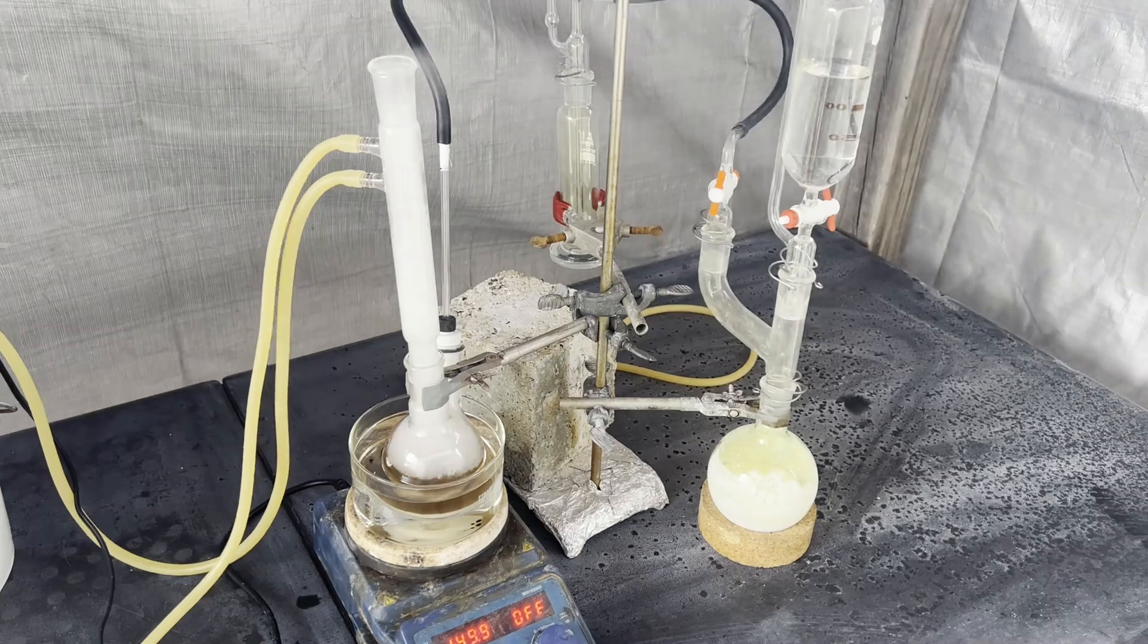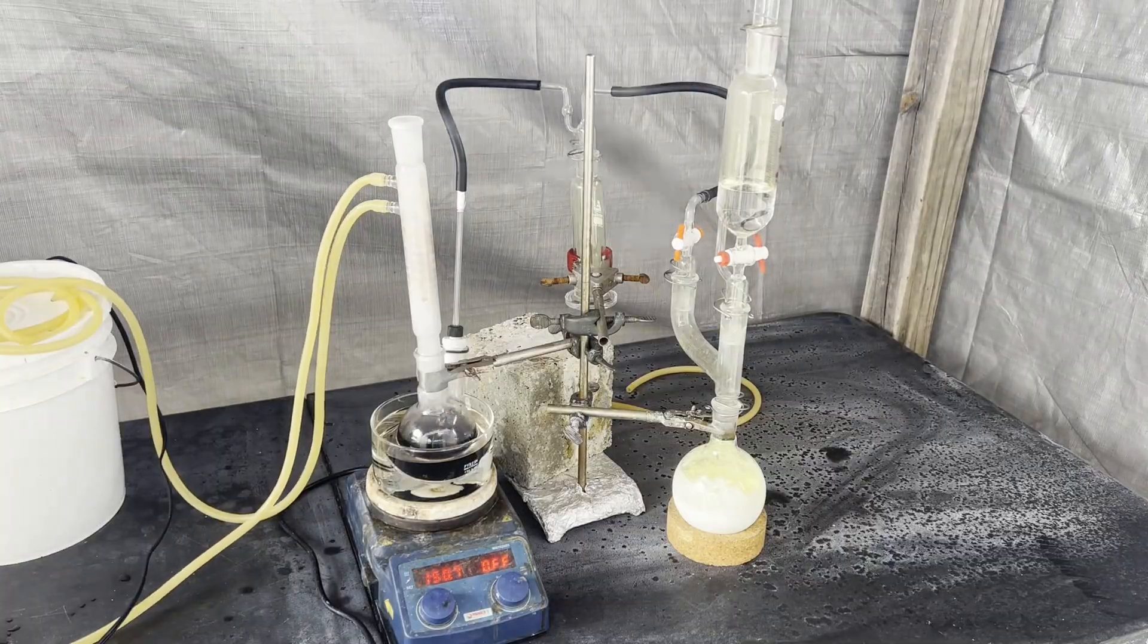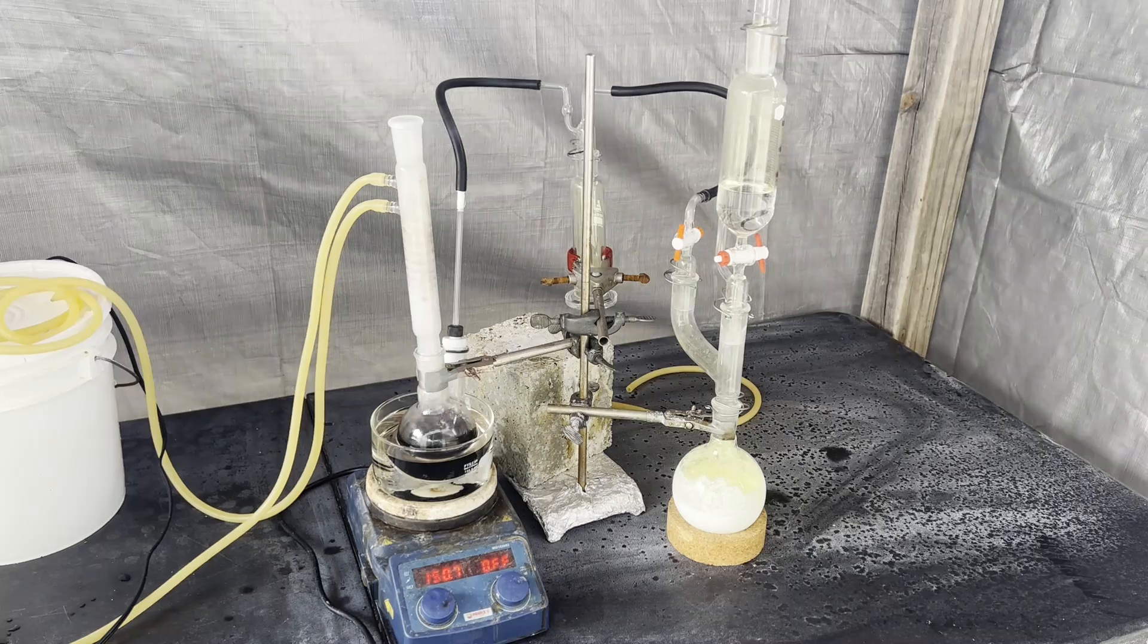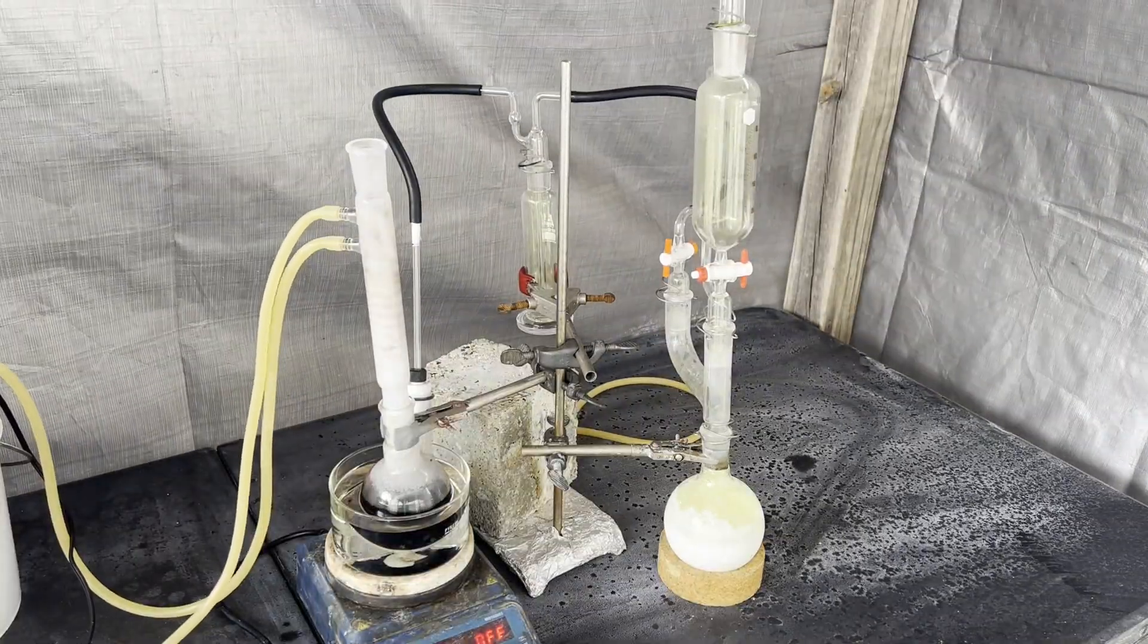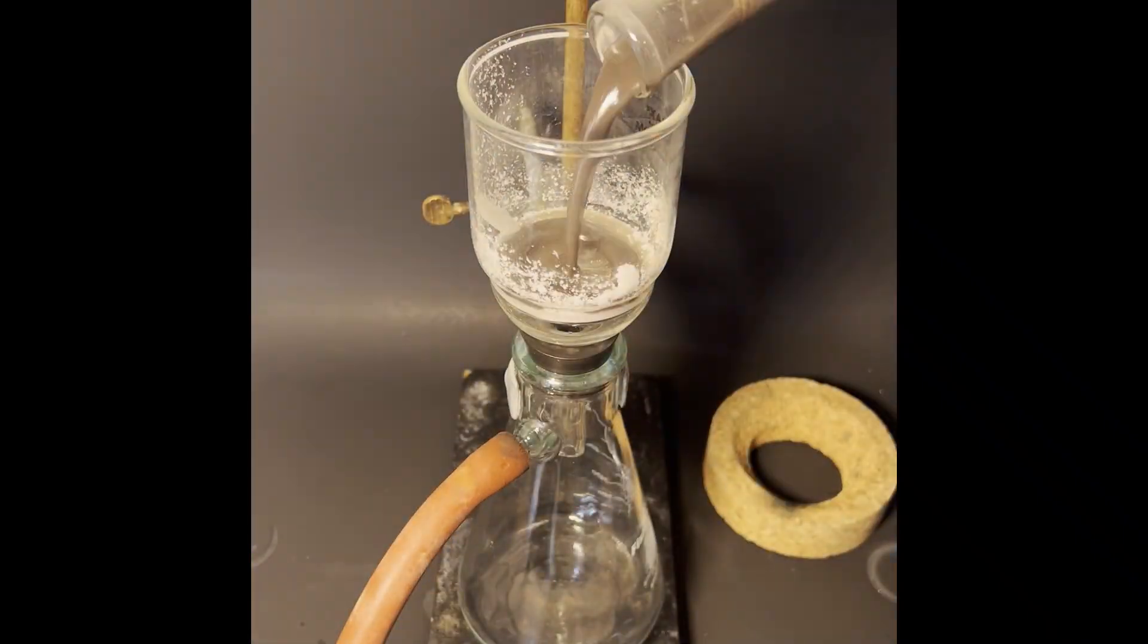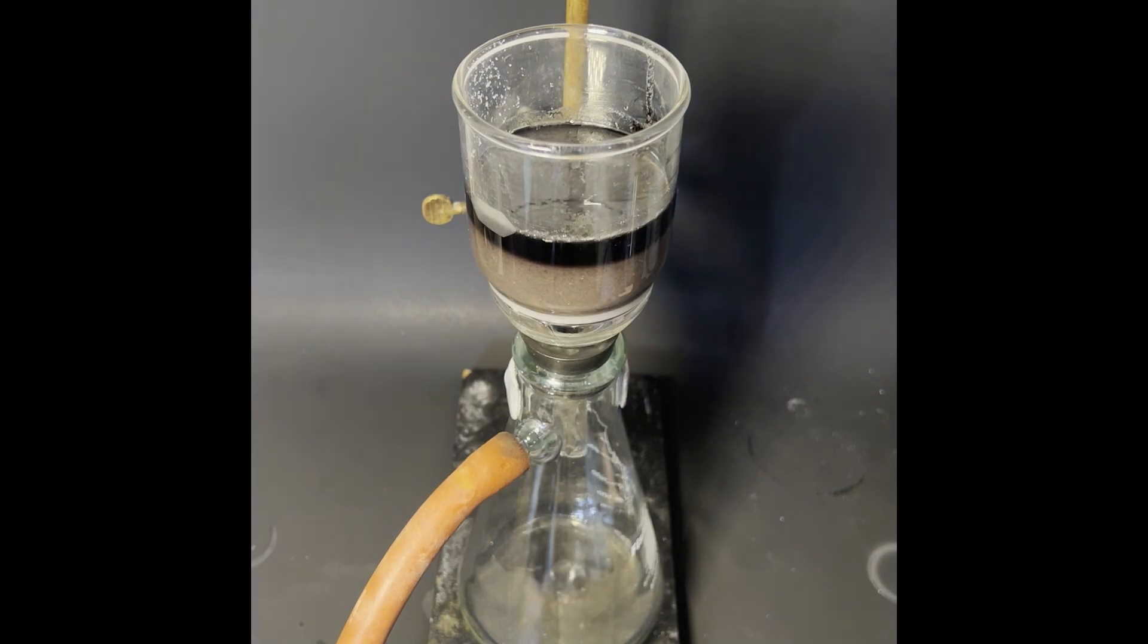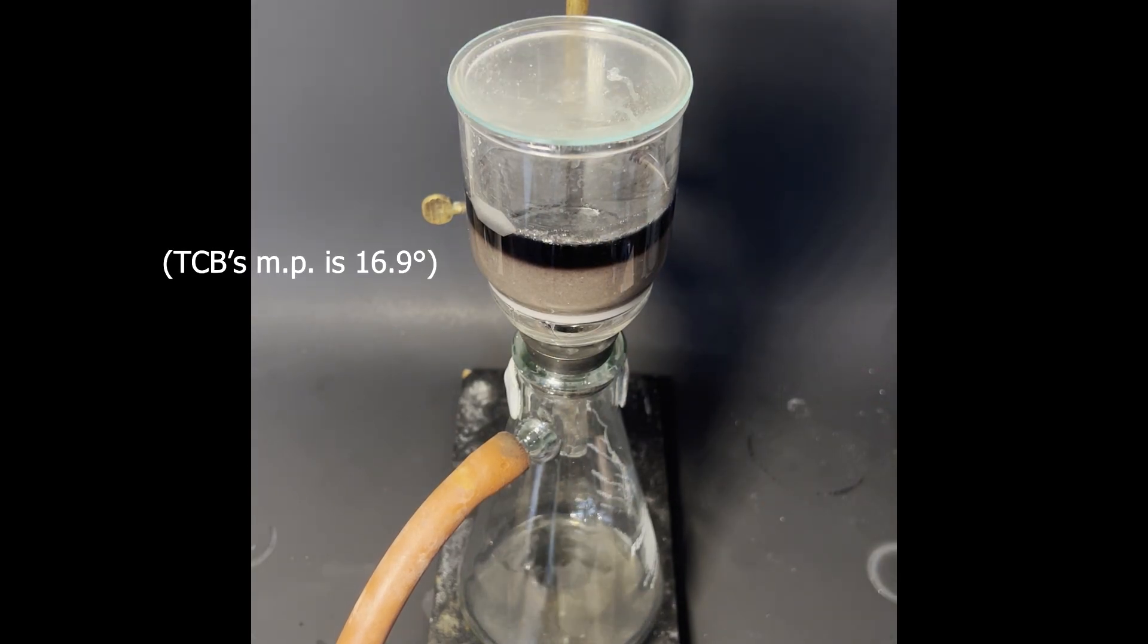I remedied the gas washing bottle suckback problem by filling it just under the tube inlet with the concentrated sulfuric acid. This didn't seem to have a significant effect on the drying of the chlorine as far as I can tell, but I don't know for sure. Afterwards, I vacuum filtered the reaction mixture to remove any of the insoluble aluminum chloride and PDCB. TCB is a liquid at room temperature, so it passes through the filter.